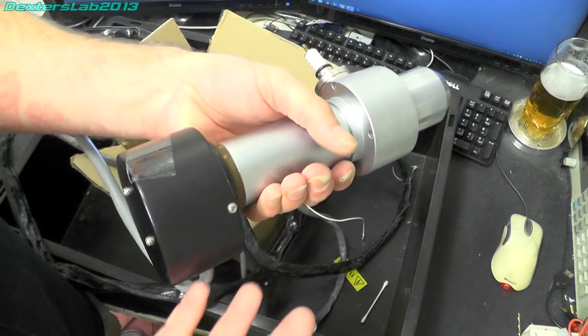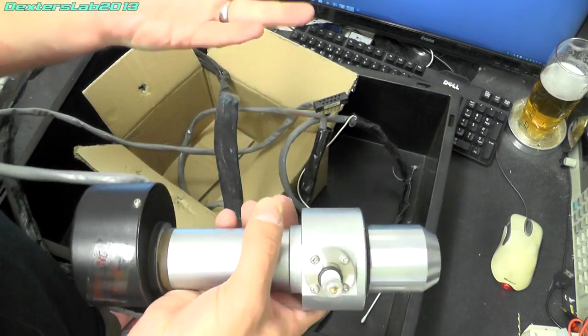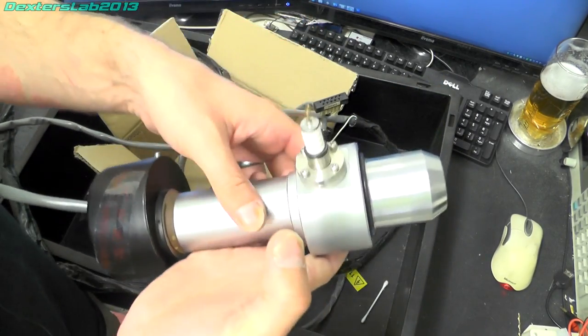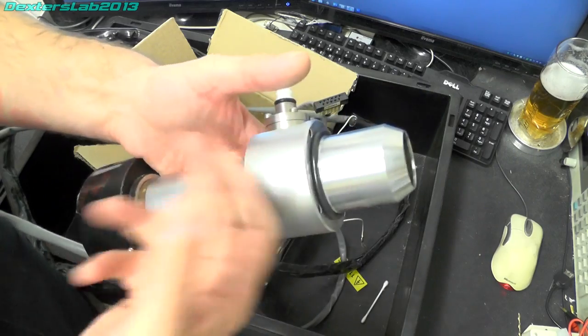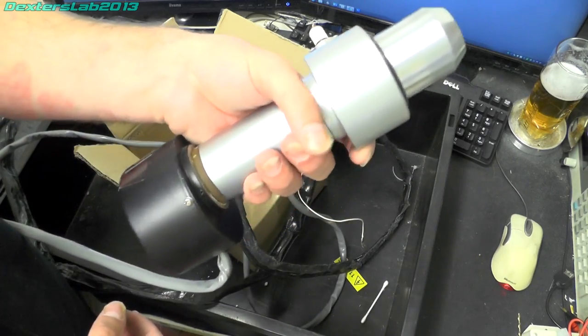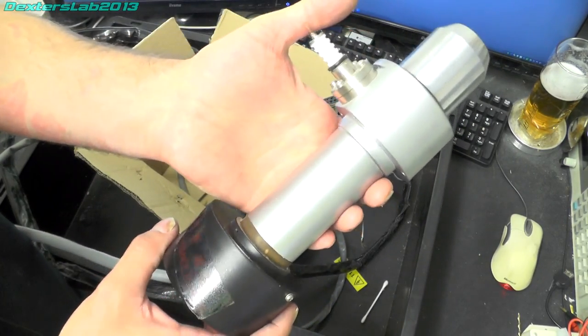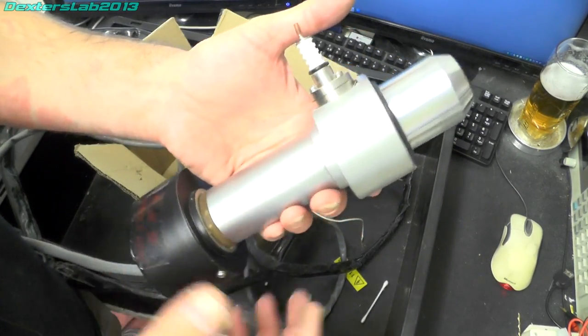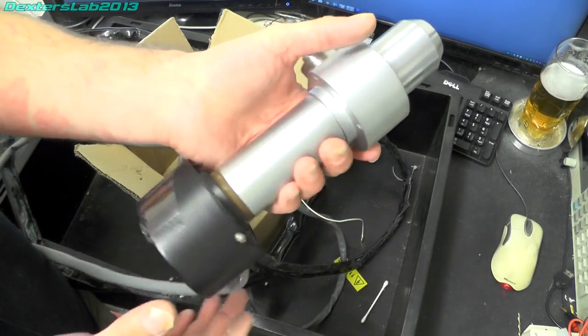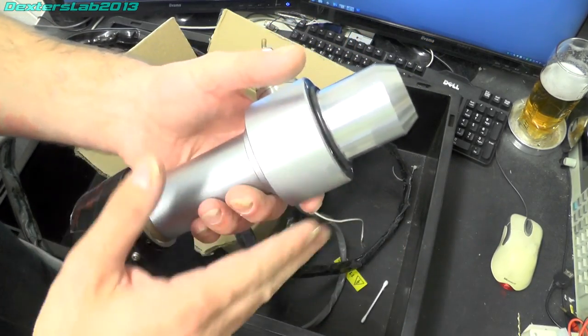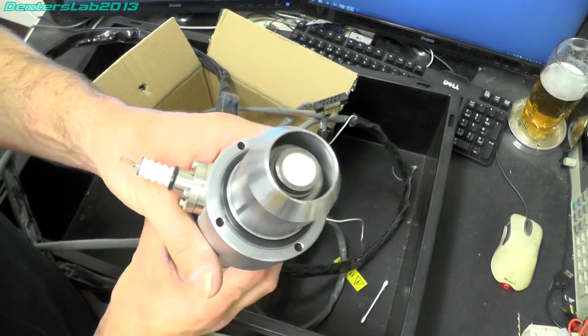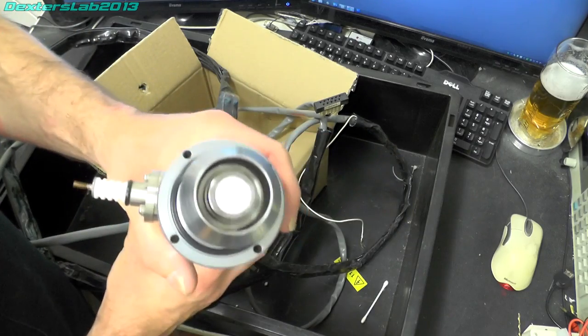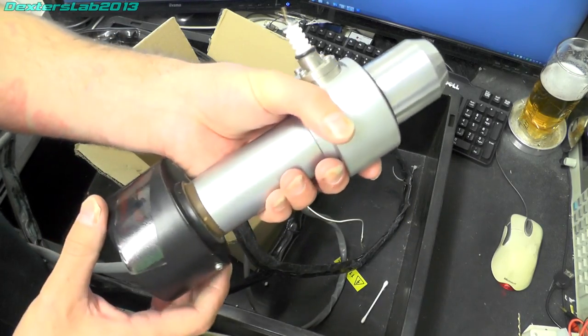One of the reasons why I gave these things away for free is because I don't really know if they're going to be usable or not. So it's best just to give these away. And if somebody can try making use of the whole thing or maybe even part of it, at least then somebody can give it a go and see whether it's actually usable.